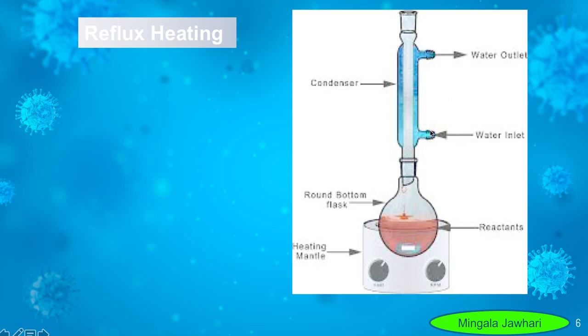So the water circulates, it is cold compared to the temperature of the gases inside. So it circulates around this inner tube, cooling the gases escaping or trying to escape and returning them back to the reaction mixture, so none of them is lost.